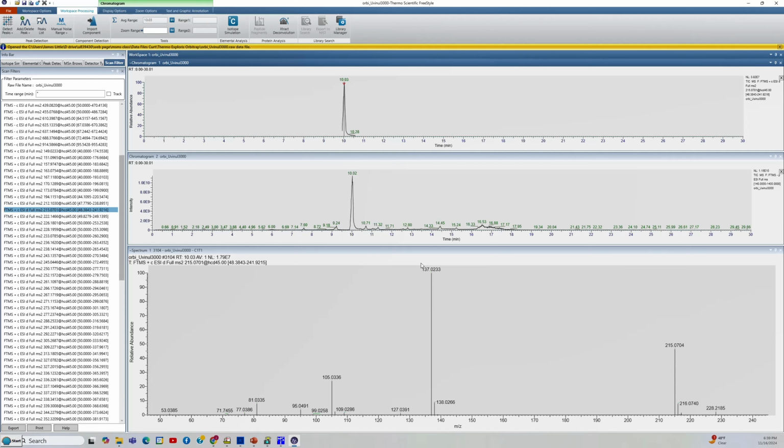So I hope you'll find this useful as alternative ways to do it. But as I said before, I really think the first way I showed you, where you have separate windows, in the first video I made, is the preferred method and the way you should do it.